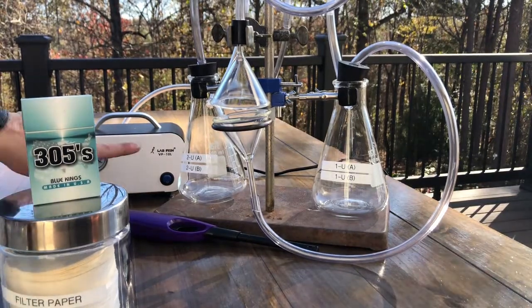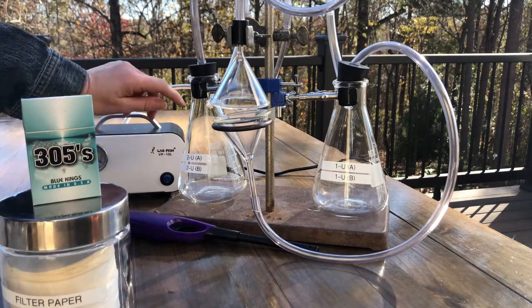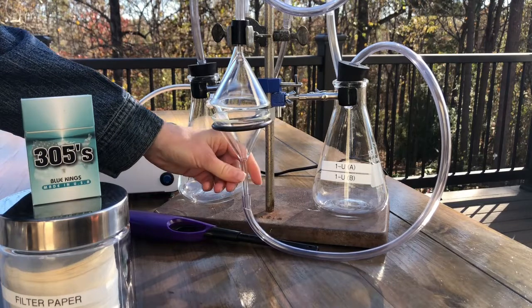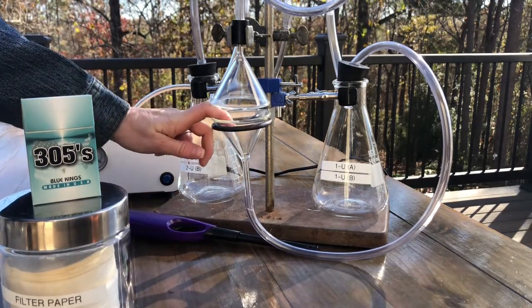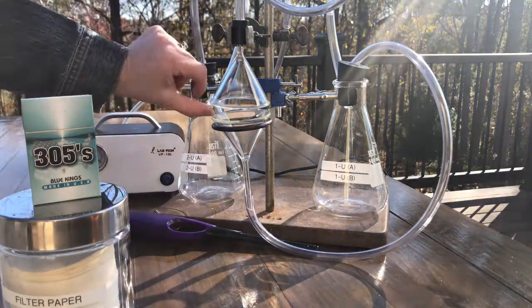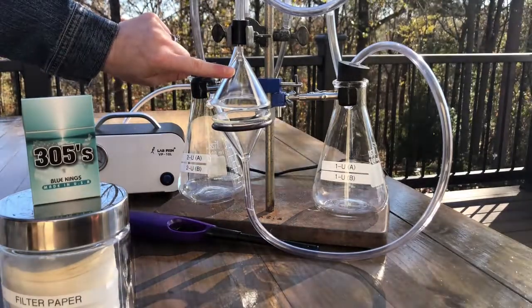Okay, so for example, we're gonna be running our unfiltered, that's you down here on the bottom, and our filtered on the top. What we're gonna do is, this funnel here is going to be our first-hand smoke. So we're going to place our unfiltered cigarette in here, and this is going to sit above it with a little bit of an air gap, all right?